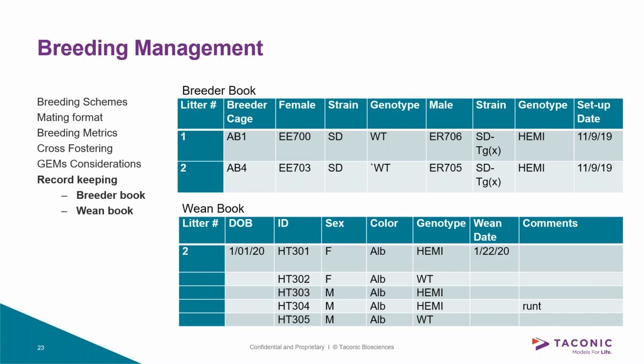So I hope this has been helpful for you to manage breeding rats, and wishing you much success. So again, it's focusing on normal, keeping the proper records, and then understanding what to troubleshoot and what to work through first when there's difficulties happening within your rat colonies.